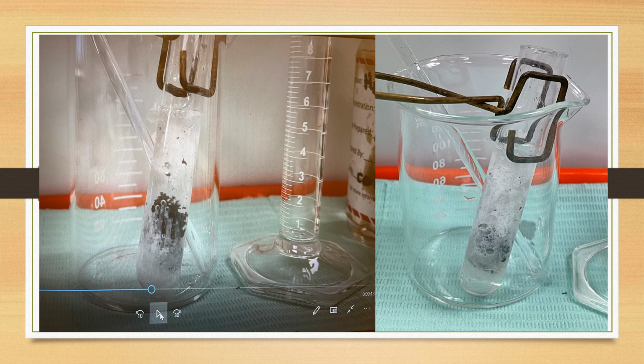In this slide, you see the slow formation of gelatinous solid aluminum hydroxide. I would like to highlight that a 150 ml beaker is used for cooling down and to hold the test tube securely.